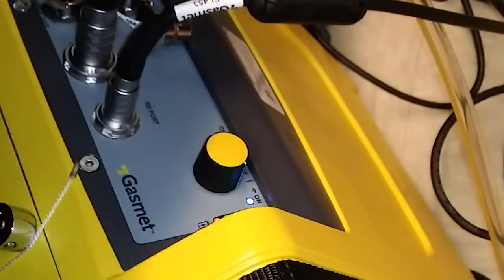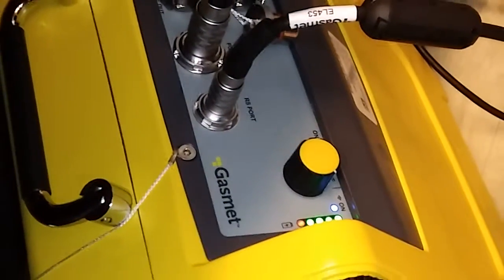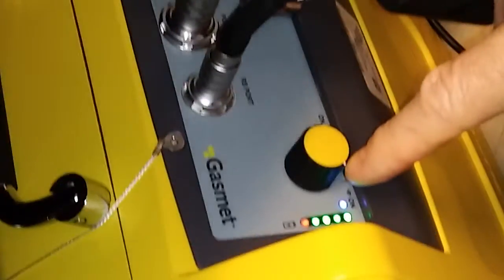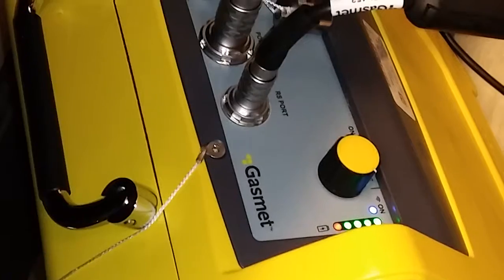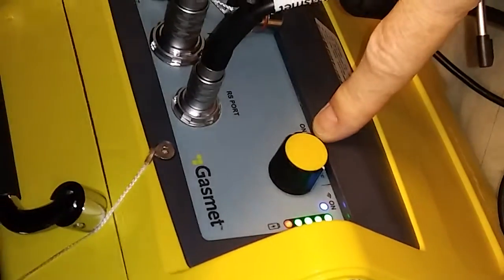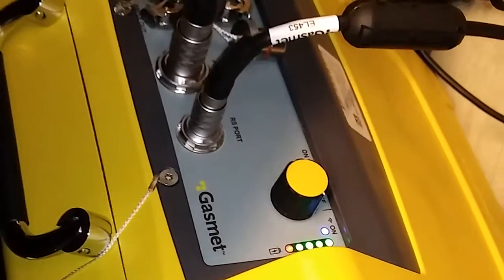What's the function of this knob? It's in the blue. It connects to the blue. If I turn it straight down, see there's a little indicator here? If I turn that straight down, it'll shut off the instrument. Now it's only on charge. If I turn it all the way to the right, it says cable. It'll be connected to the cable, which will be connected to the computer. Okay, Bluetooth to cable.